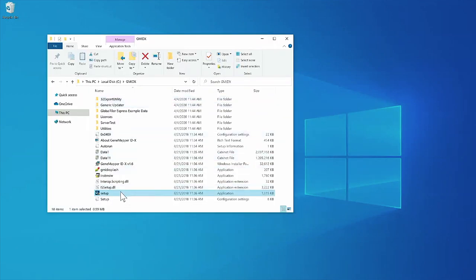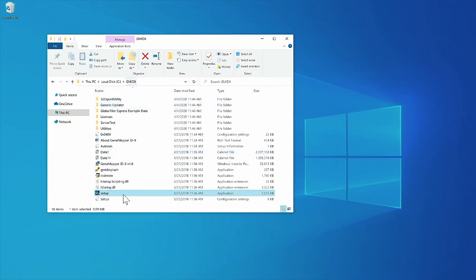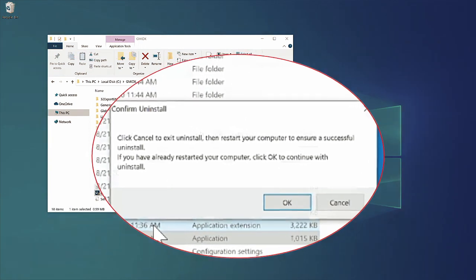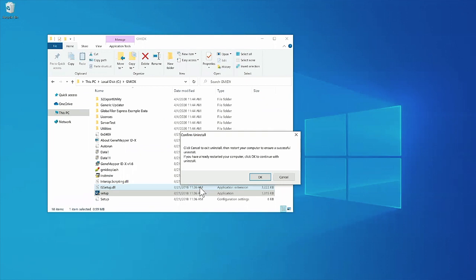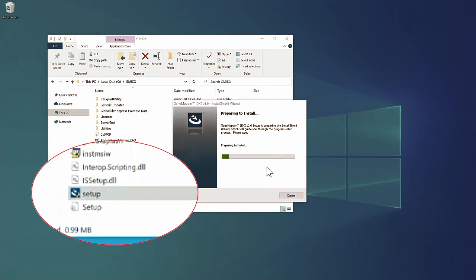To begin the installation process, double click the setup.exe file inside the installation folder. It will begin the InstallShield Wizard, and you might see a pop-up window confirming uninstall of any previous version. If you have already restarted your computer following uninstall of a previous version, or if no previous version was installed, click OK and continue. However, if you have not restarted following a previous uninstallation, hit cancel, uninstall the software, restart the computer, then relaunch setup.exe to continue.